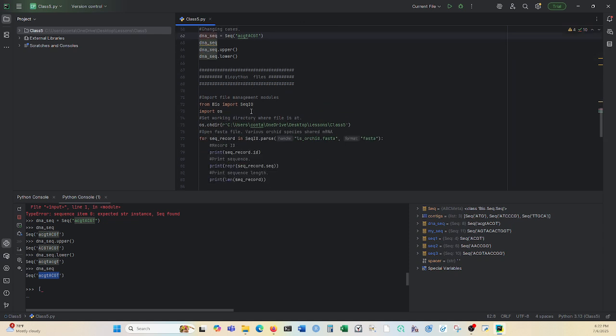All right, now let's get into Biopython files.